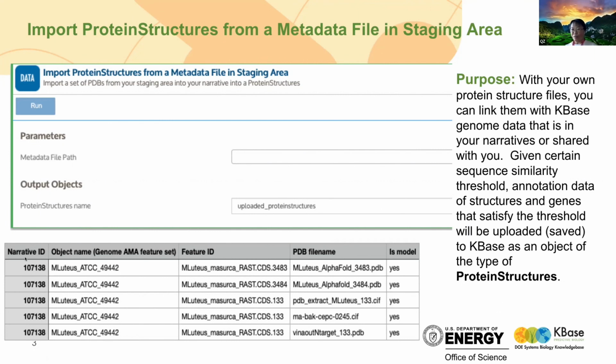This is a KBase term. You have to have a KBase account, and then you can create all kinds of narratives. You can see the narratives other users shared with you or public, like today's narratives. So go back to the previous slide.